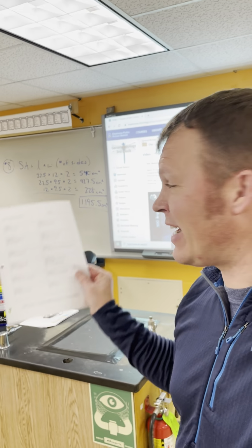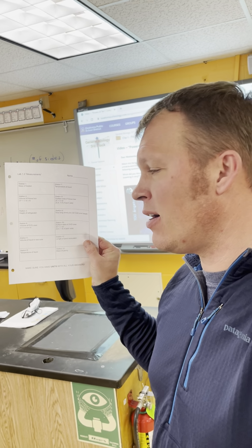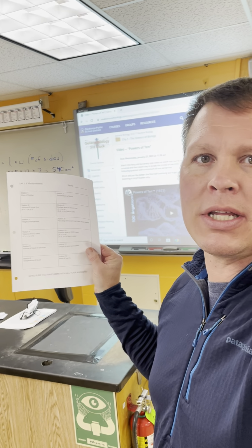Okay, Mr. Muir here, Biology Measurement Lab. You should find a digital copy of this sheet with the 12 different stations. I can't bring all this stuff to you if you're working virtually, so you're gonna have to do this virtually. I'm gonna walk you around the room to each of the 12 stations.